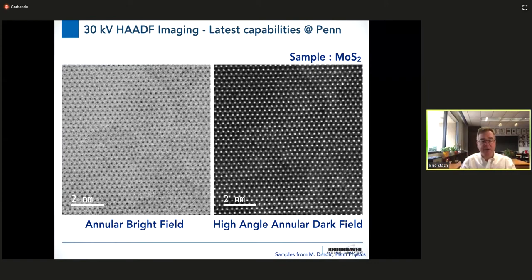Okay, so that was the section on imaging, right? We have diffraction contrast, which allows us to understand how the diffraction events impose their information upon an image. And we have both the high resolution phase contrast and the high angle annular and other types of STEM imaging modes that allow you to see things at the atomic scale.